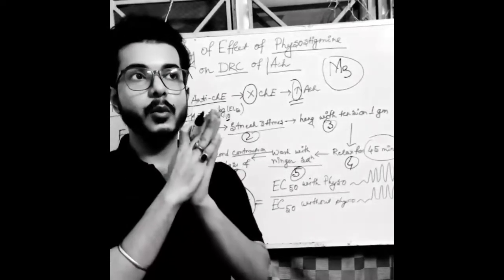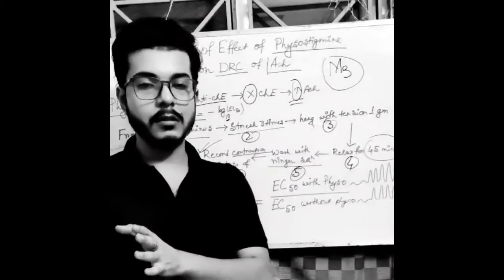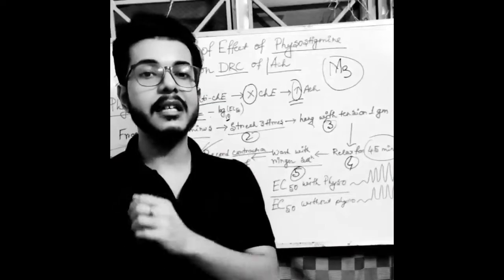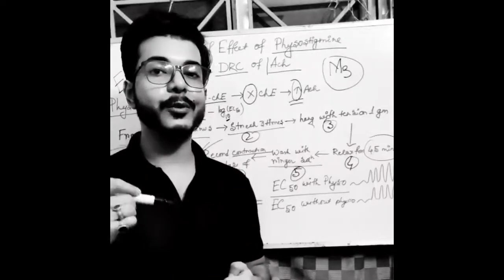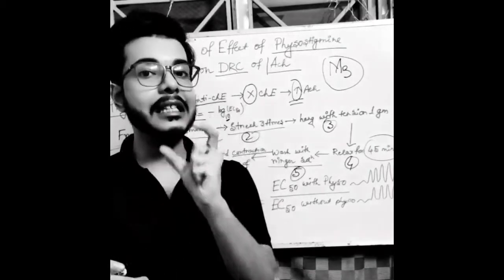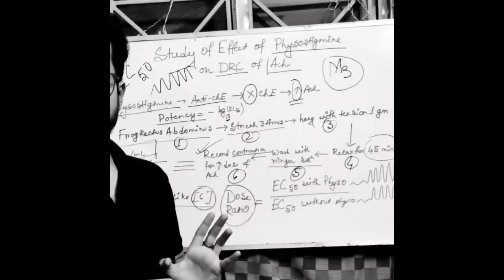So whenever the time is 6.01.30 p.m., 6 hours 1 minute 30 seconds, at that time we will give our next dose, that is 0.3 or 0.5, whichever it is going to be. So between two doses we have to wait 90 seconds. We have to give 90 seconds of time for each dose to show its action. This information you have to implement in both experiments.